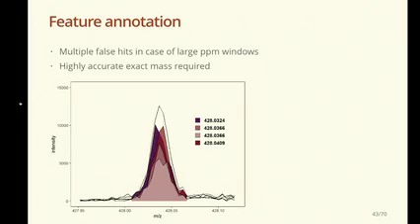So what might be a better solution? Maybe we can fit a composite spectrum, so like a summation of all the individual spectra, and then use the MZ value of this composite spectrum as a better estimate. But even there, you still get quite a lot of false hits. And a better estimate would be to fit more of a Gaussian distribution to it, as we, of course, would expect all of these mass peaks to have a Gaussian distribution, and certainly for the larger intensity mass peaks they do, but for the lower intensities they don't, because you have this variability across mass peaks. Of course, depending on the mass analyzer, it might be better for one, might be worse for another, but let's again assume the worst in our data.